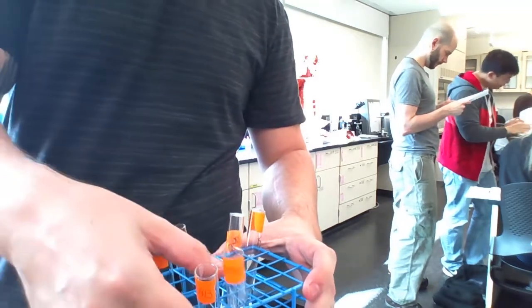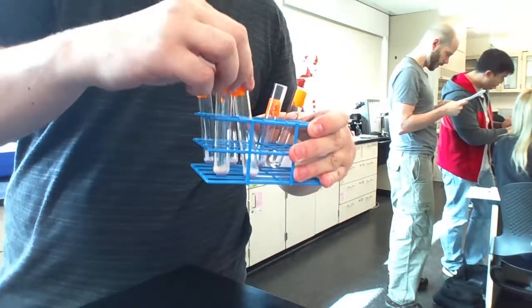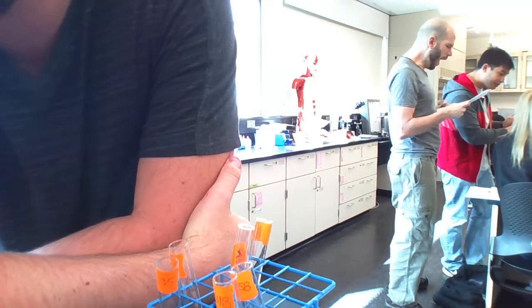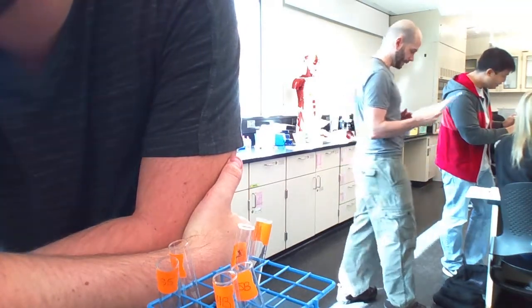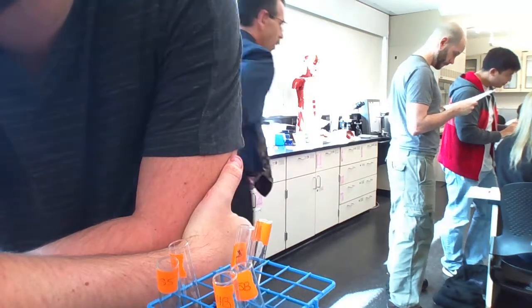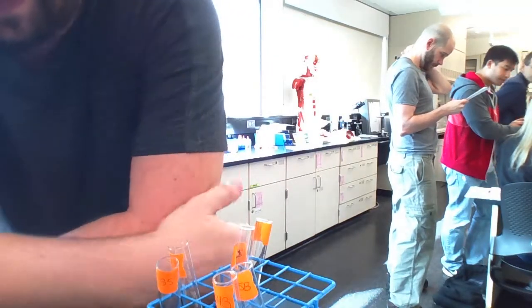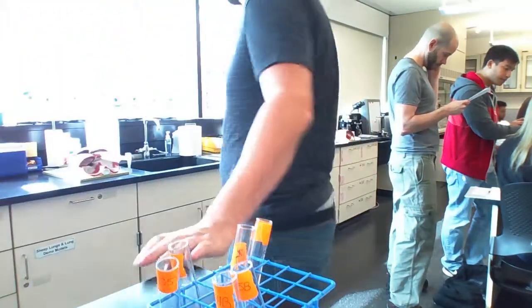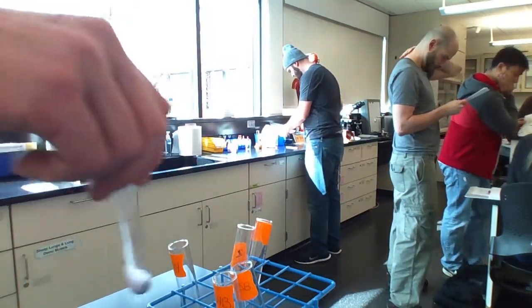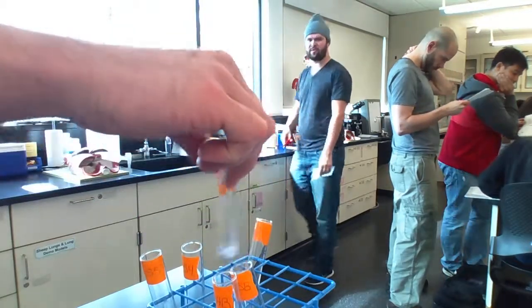Put a pinch of bile salts. Pinch of bile salts in 2, 4, and 5. You remember? Yeah, we do. Where do we put it? And shake. Put it on the top, and then you shake to mix the contents. Each tube. All of them? Yeah, just cover the finger. They're not full enough for it to matter. It's okay.